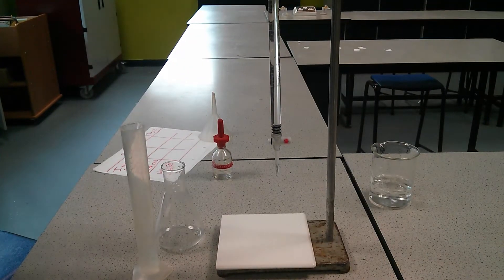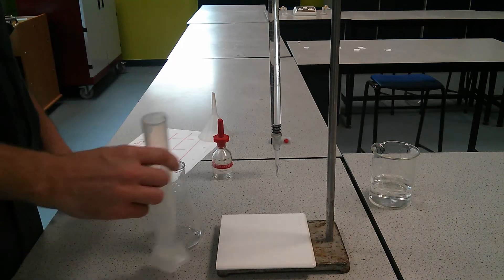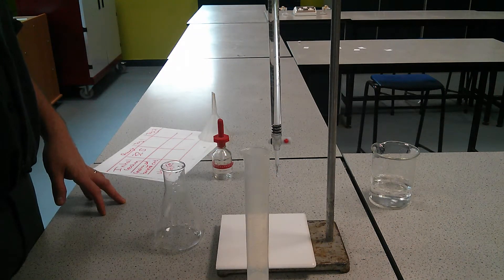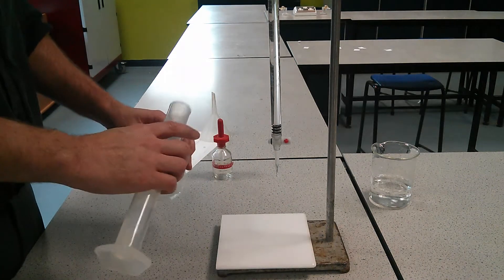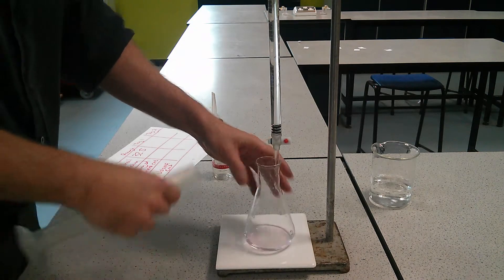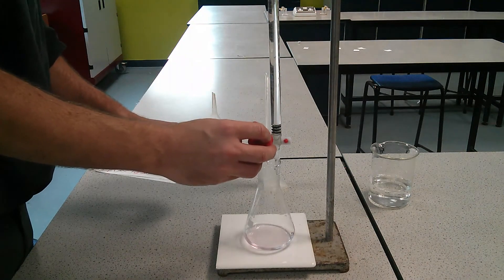We did our rough reading. Next, what we're going to do is get a better reading. So again, we measure out 25 centimetre cubed or 25 millilitres of sodium hydroxide. We place that into our conical flask. And add one or two drops of phenolphthalein solution.